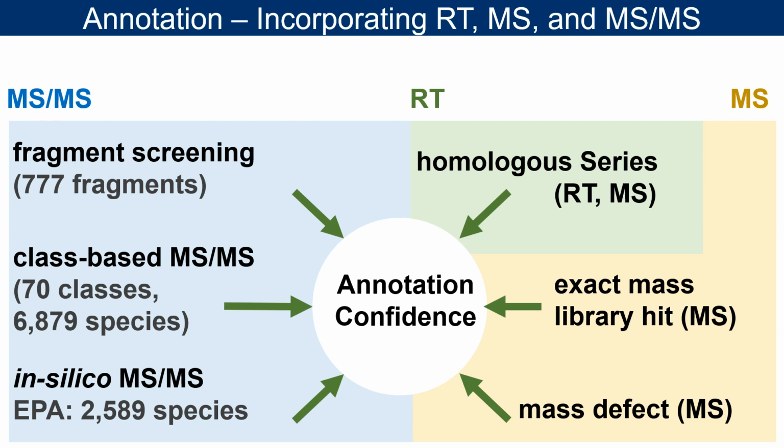We develop the libraries based on standards for each homologous series that we include, and we look at the MSMS, and then develop fragmentation rules, neutral losses and fragment ions, based on 2 or more standards for that homologous series, and develop rules of which fragments must be observed for that compound to be annotated.